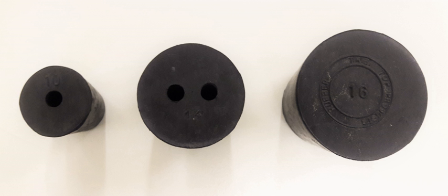To prevent liquid chemicals from leaking or escaping the container, the rubber bung should fit tightly to the container's opening. Therefore, the dimension of the rubber bung is of concern. These are some of the sizes that are commonly seen in chemical laboratories.